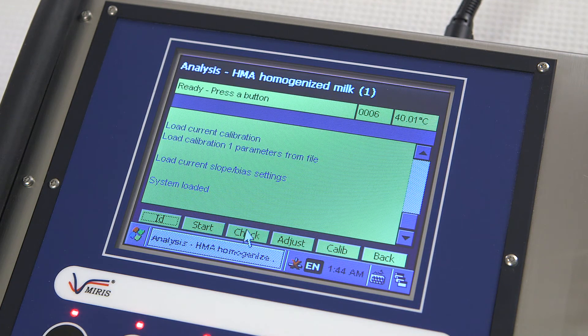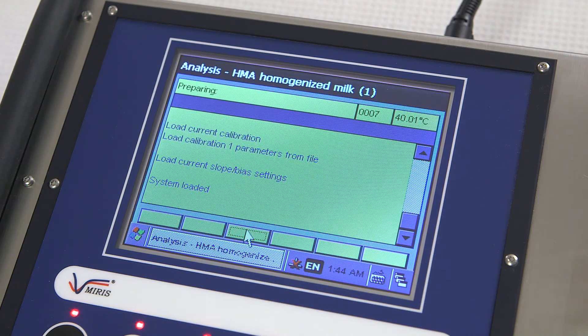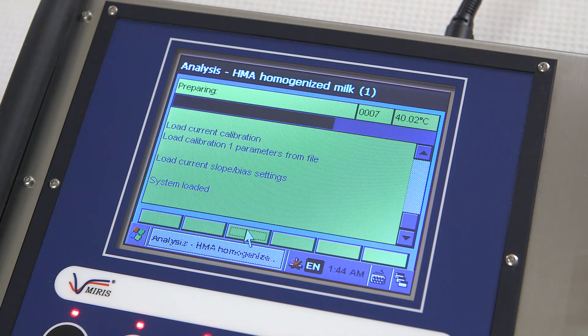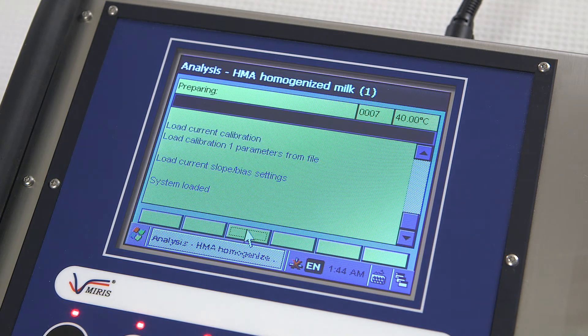Press the check button and wait approximately one minute. When the process is complete, a pass or fail message will appear. If there are any problems with checking the zero setting, then follow the instructions on the screen.